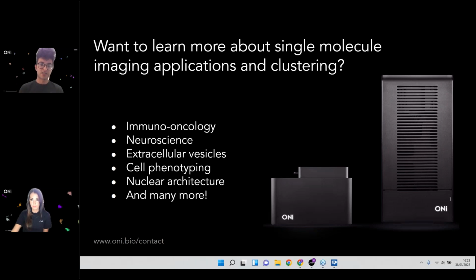However, depending on how you process your localizations, what kind of steps you do to filter, what kind of steps you do in sample preparation, and how your experiment is set up, like is it a dSTORM experiment, is it a PALM experiment, which type of localization microscopy are you using, there are ways to get around that, and we would love to talk to you about the details of trying to set thresholds and figure out quantitative ways to answer your biological question. But there's not a clear-cut way for me to say yes or no to that question right now, unfortunately. It depends, as I'm sure you're familiar with in many things in the life sciences.